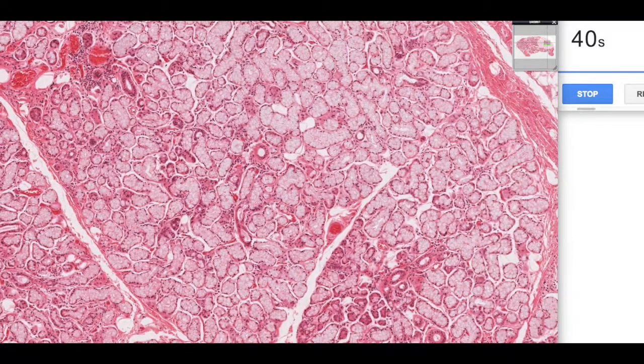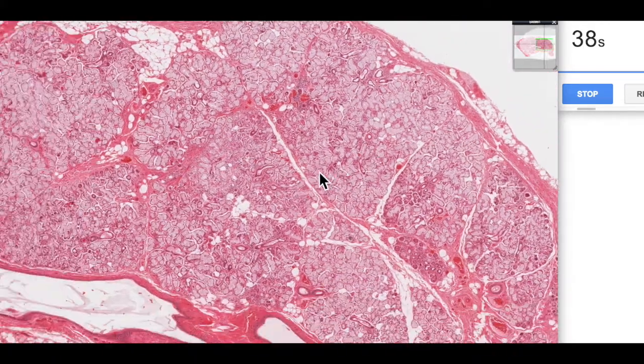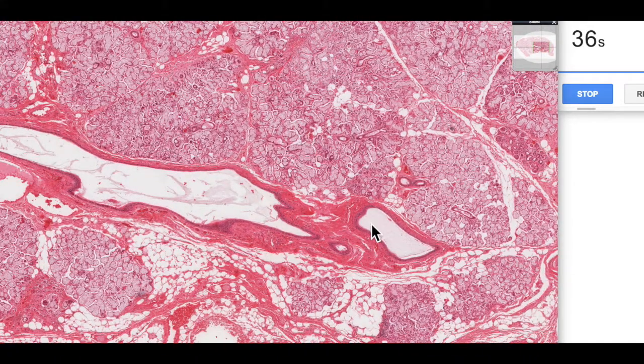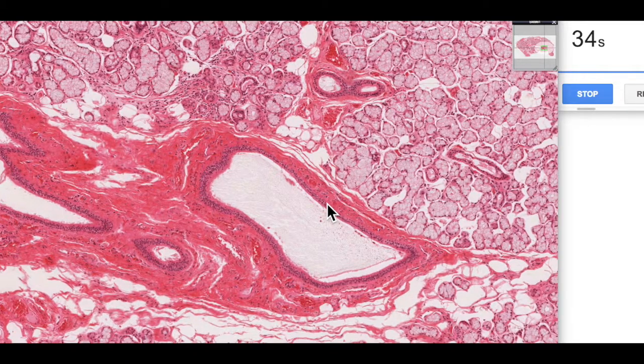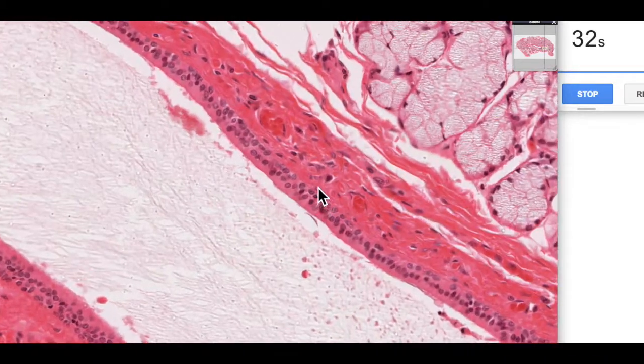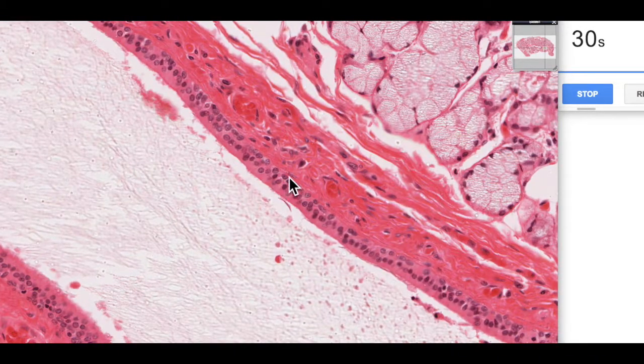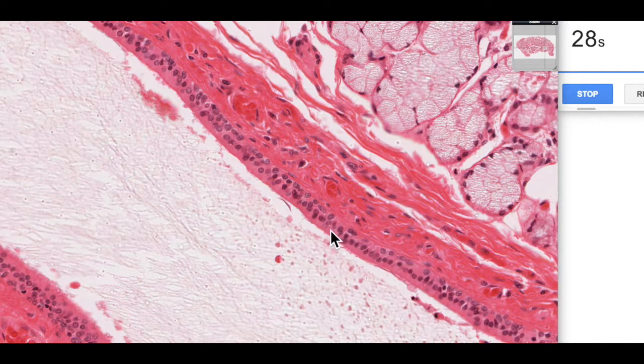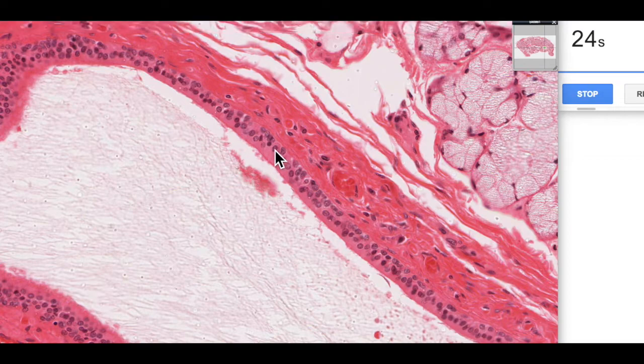If we zoom out a little bit, we can see some of the other features here. There's a nice big lobar duct here. If we have a look at this in a little bit more detail, we can see this stratified cuboidal type of epithelium, a thick epithelium which is going to be a nice conduit to this secretion here.